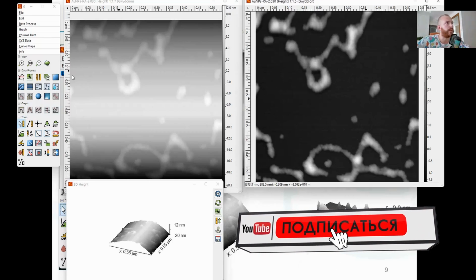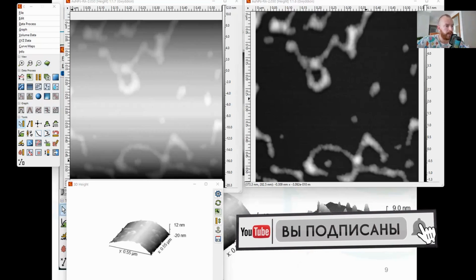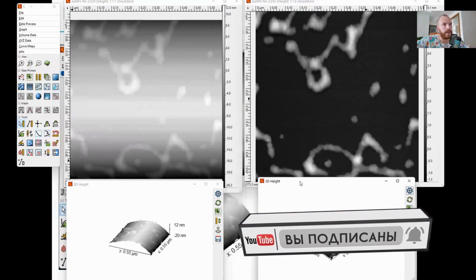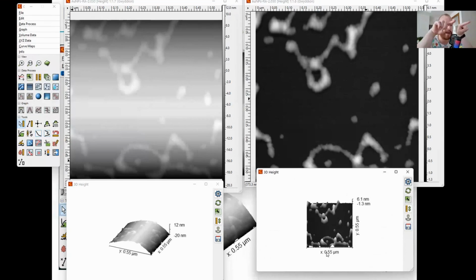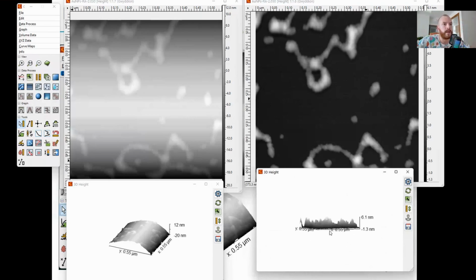And also, if we press here the same button, it's like that. So you see, it's flat. So we flatten the surface. Again, by aligning the rows, it also does some flattening. So it changed this curve to more flattened. Yeah, you can see it like this.